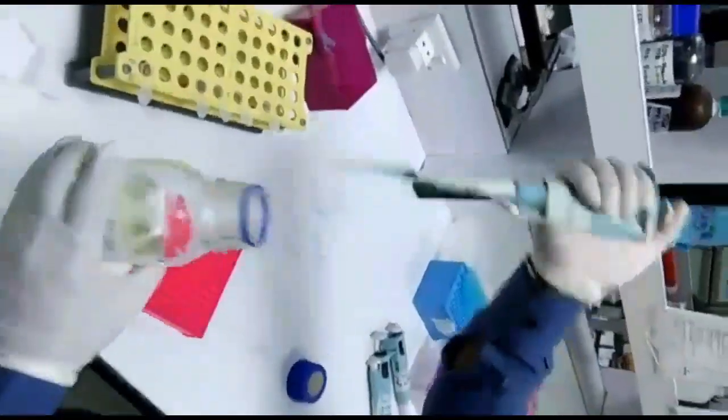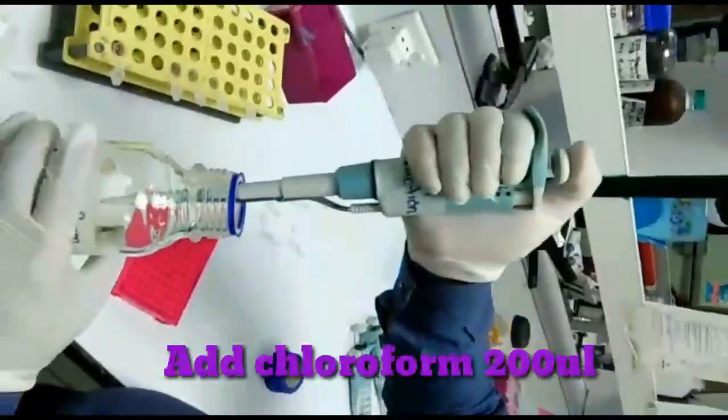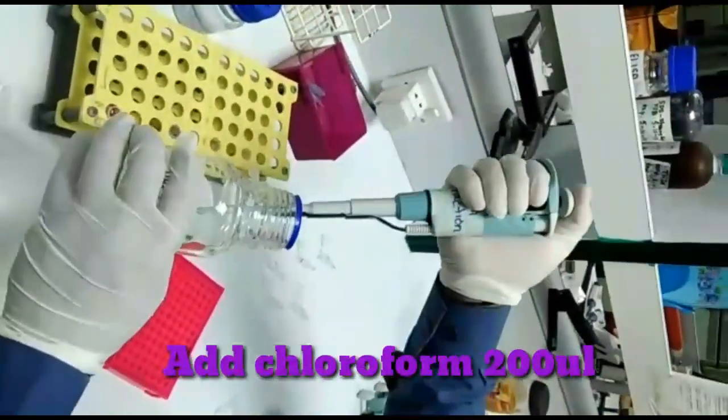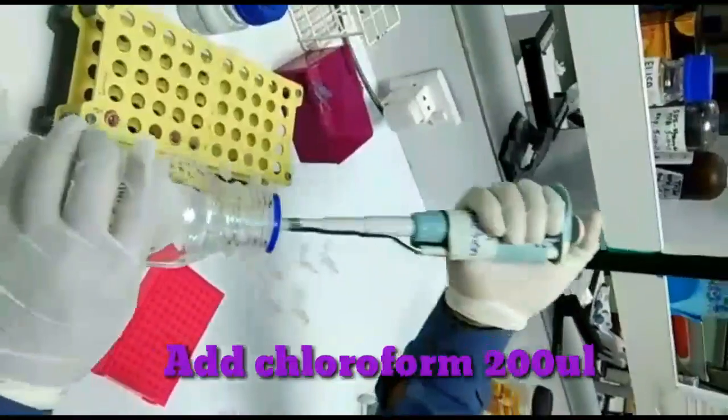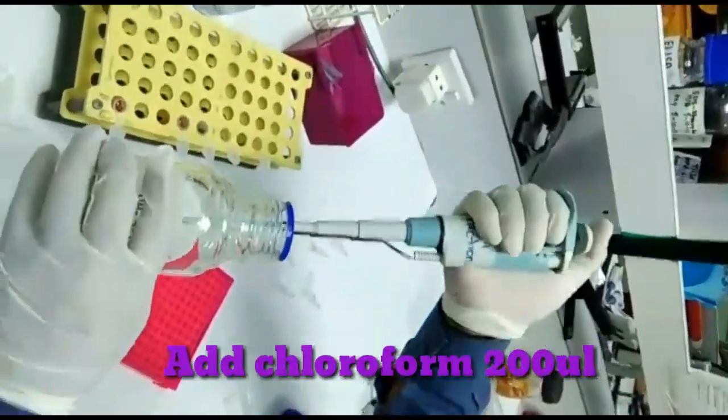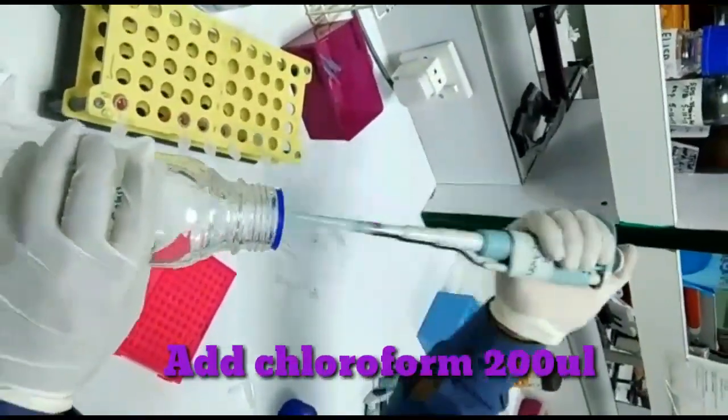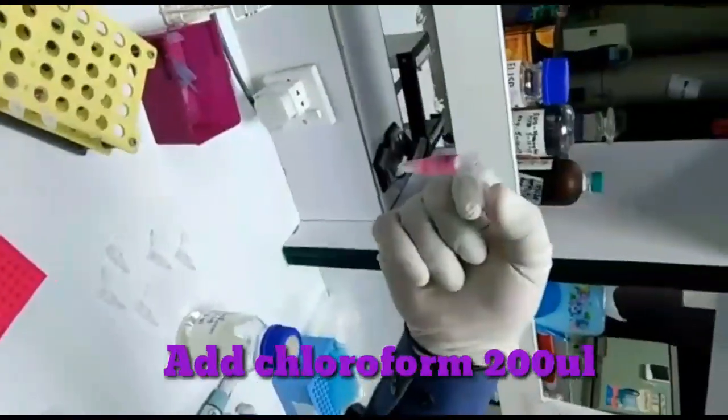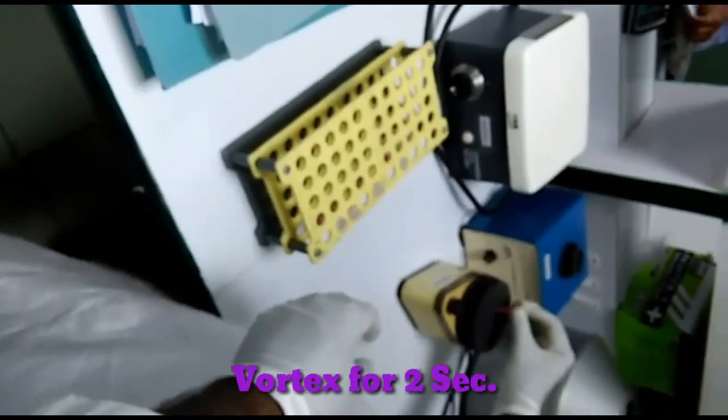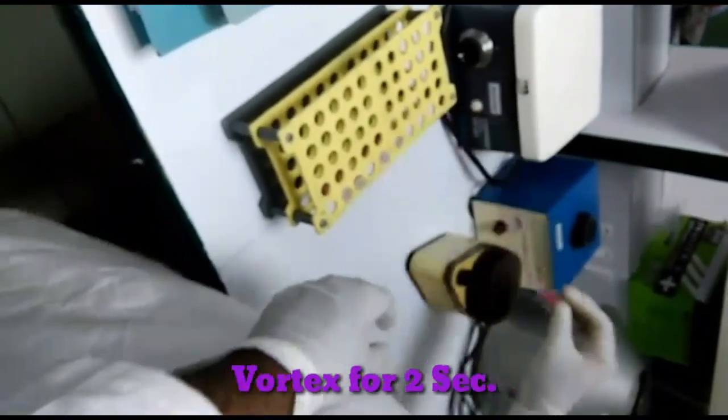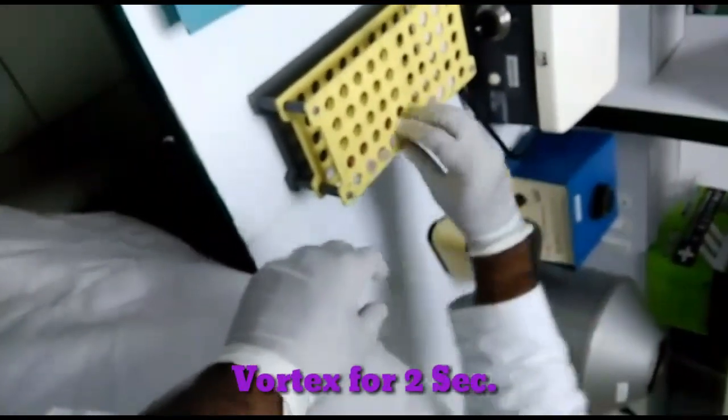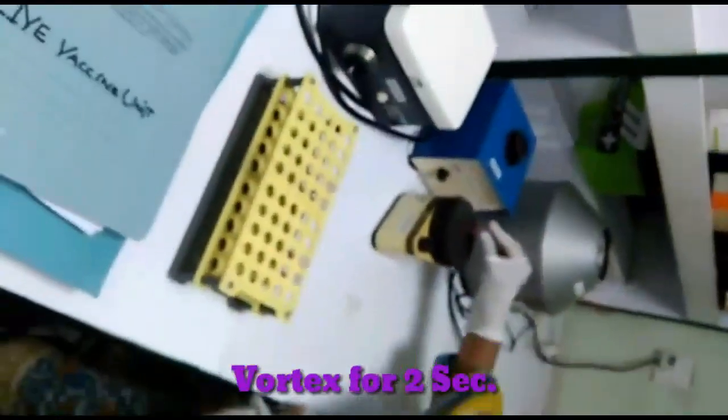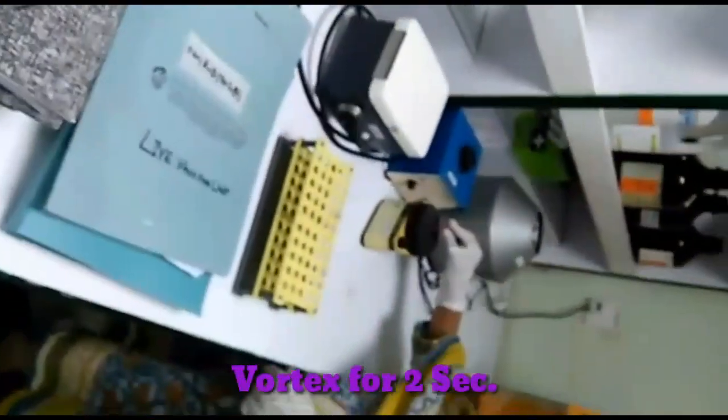After that, add chloroform 200 microliters in each sample. We are mixing each sample for two seconds. After vortex, incubate the sample for 15 minutes.